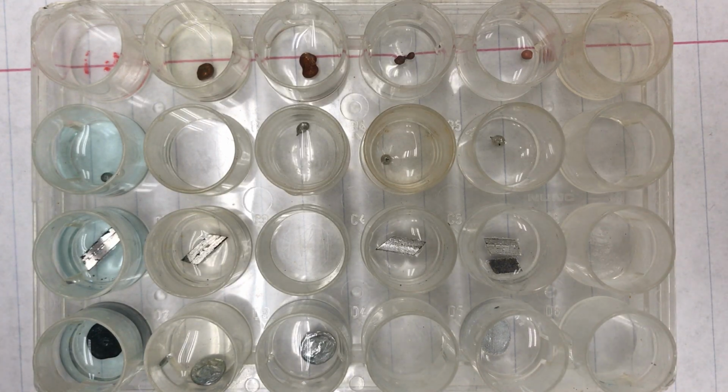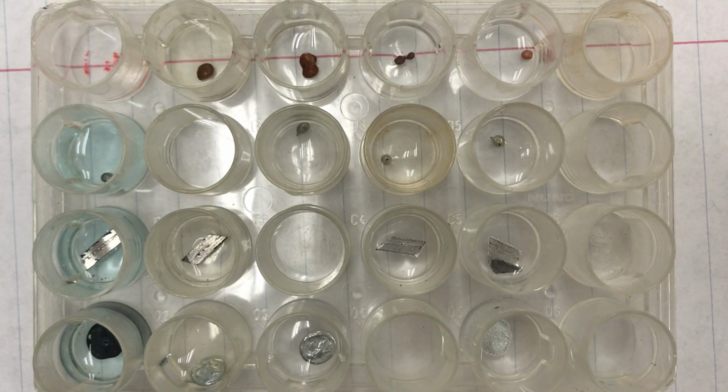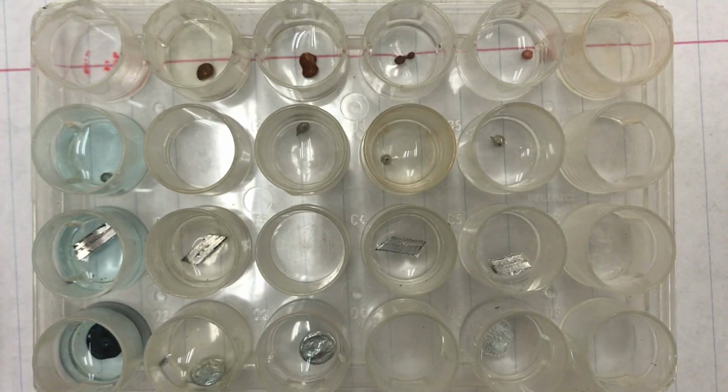For example, we have zinc, this bottom one, with the copper sulfate down here. We saw that as soon as we put the zinc into the copper sulfate, it turned immediately from silver to black. So you should make that observation in the box that matches up with that space on the well plate.